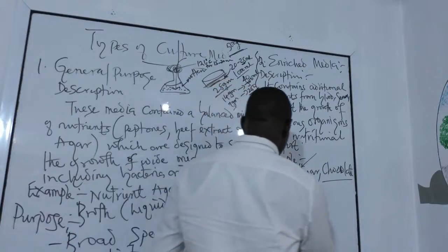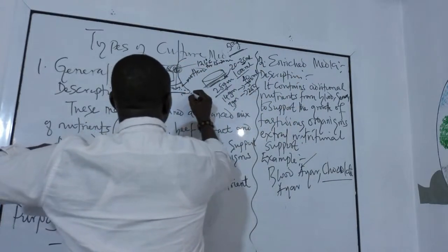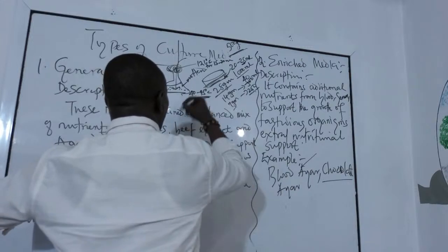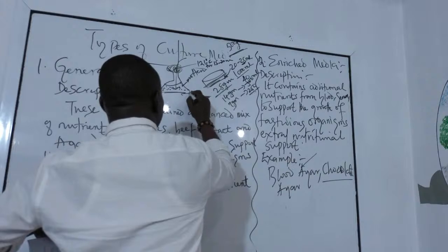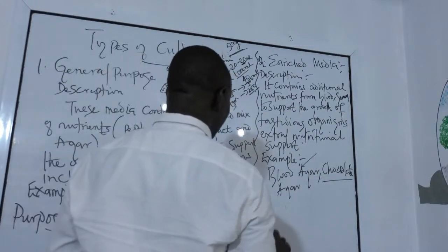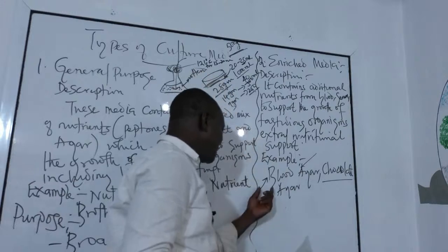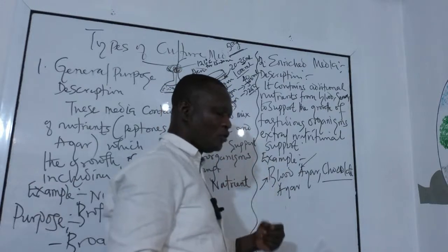But when this has cooled to between 40 and 45 degrees centigrade, or even below 40, a maximum of 40 degrees centigrade, that is when you add the blood. Because it is no longer hot, the blood color will not change.